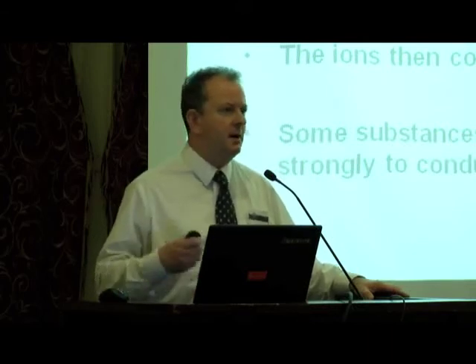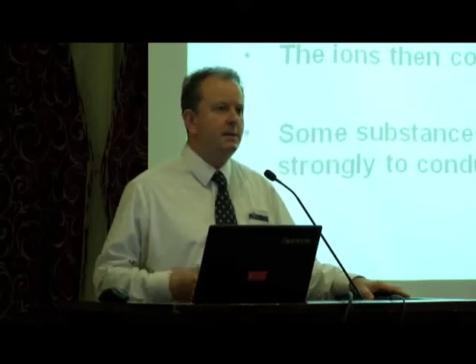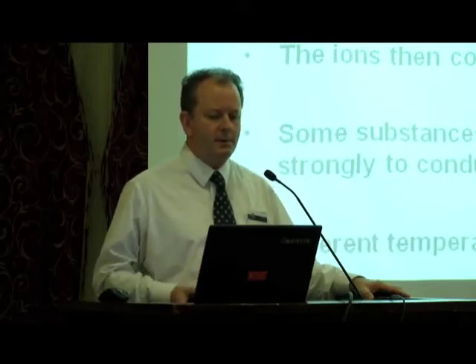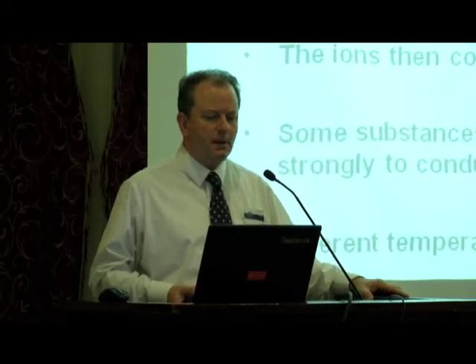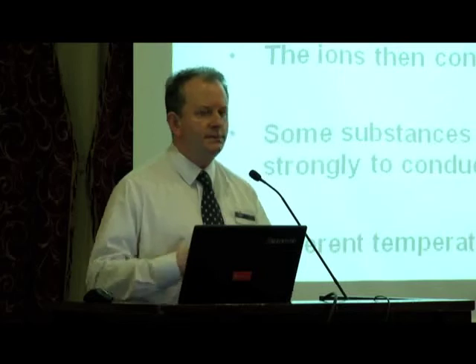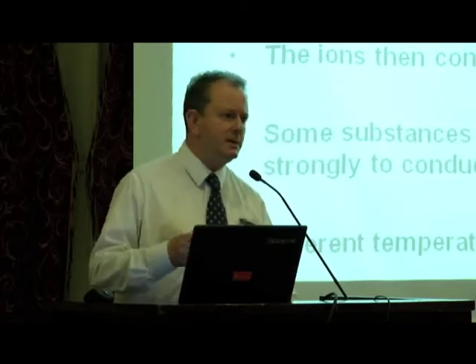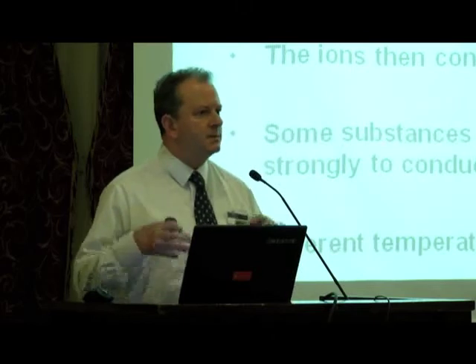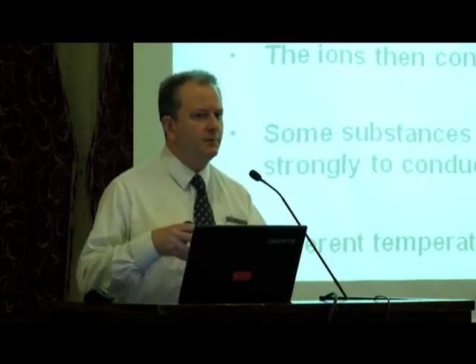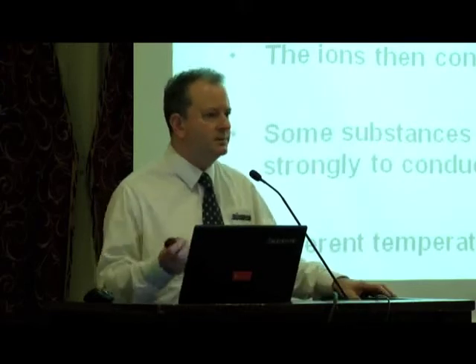So acids, alkalis, very reactive because they dissociate very easily and they react very strongly. So we have different materials in the water, different compounds. Each will dissociate sometimes easily, sometimes harder. So the conductivity measurement of the water is dependent on the chemicals in the water itself.